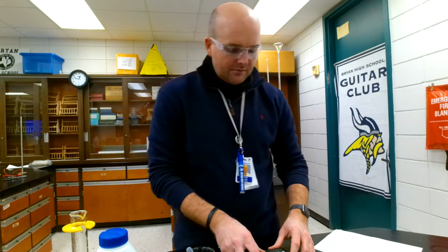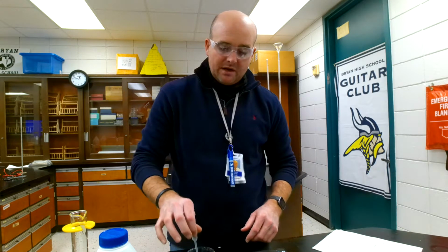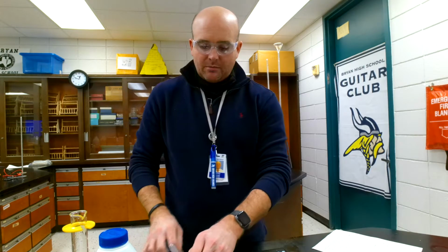Now, what is going to happen is once I pour the bleach in there, the reaction will start. I will then immediately take this out, pipette some into a clean cuvette, place it in here, and then start my experiment. So you may be wondering, in all of our classroom stuff, we've been thinking about concentration versus time. Well, in this one, we are going to measure absorbance versus time.